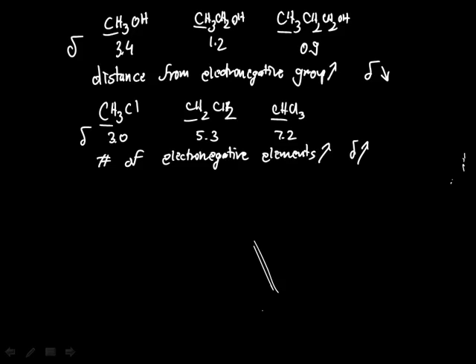Now, the various classes of organic compounds absorb in different regions of the NMR spectrum. These will typically be given to you in a table on exams and quizzes, but it would be good to familiarize yourself with the general range of these regions. Alkanes typically absorb at very low ppm values. If we have a methyl group, this will be at 0.9. If we have a CH2 group, a divalent group, this will be about 1.3. And if we have a CH group, with 3 substituents, it will be at 1.4.